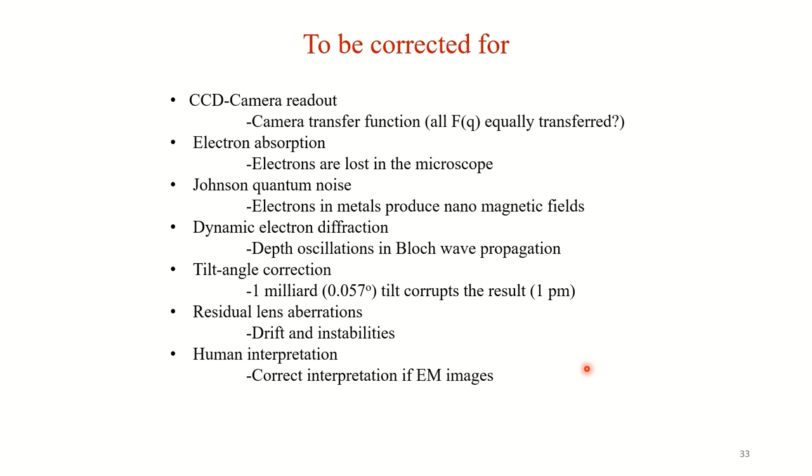Because the electrons are scattering through the atomic columns, and atoms are in the world of quantum physics. So you have to solve the Schrodinger wave equation to interpret those results, and computers do that for us. So basically, you're seeing these Bloch waves or Bloch states associated with your material on the detector plane. So you are seeing a wave function, which is a complex wave function. And that's what you are seeing, unlike the light microscope.